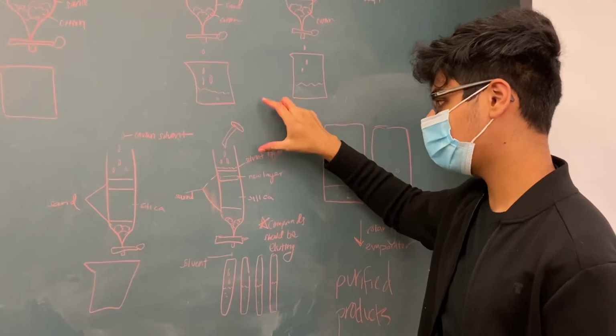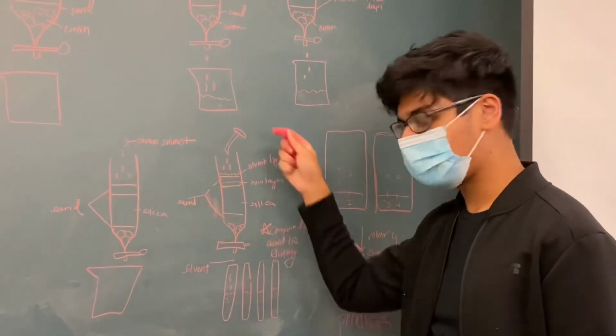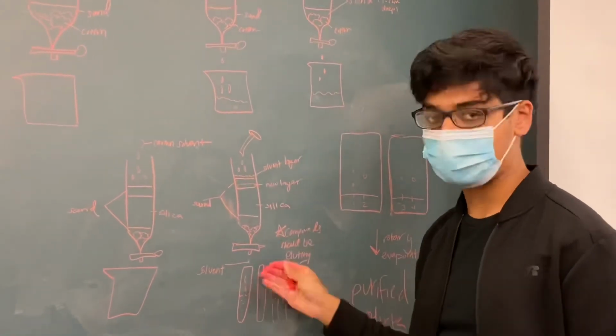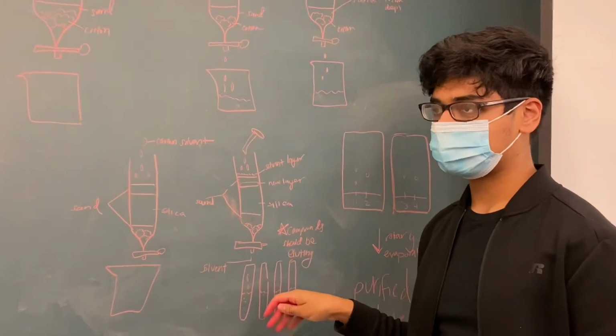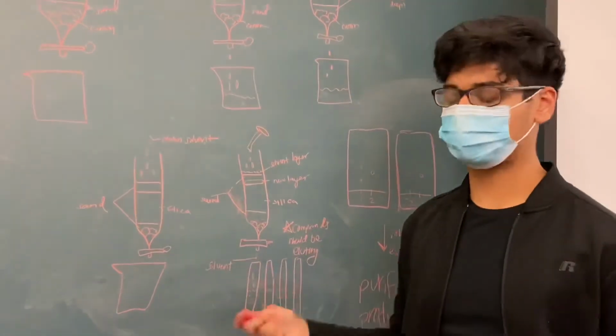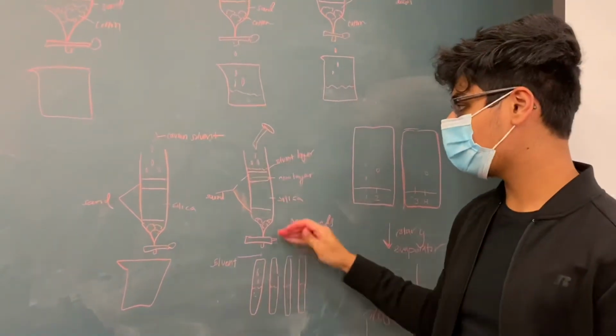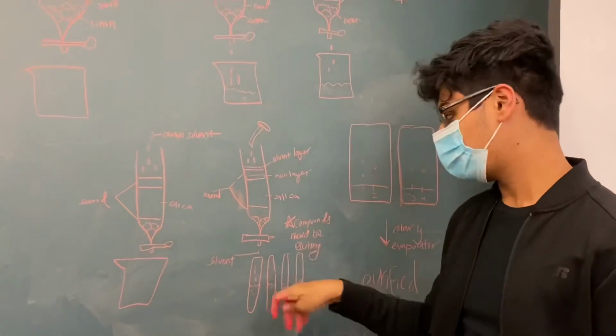After you add that, you're going to turn on the stopcock again, and then allow the whole solution to drain out into the test tubes. You're going to collect them and make sure that the test tubes are about half full. If it's over that, then you just get another one. You're going to let it go for a while until all the solvent layer is gone, and then everything is collected in the test tubes.